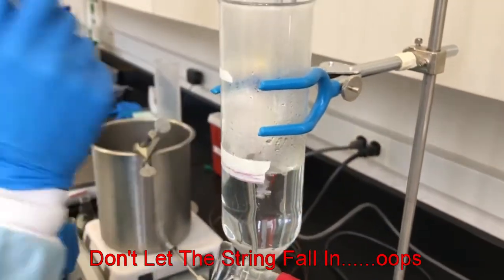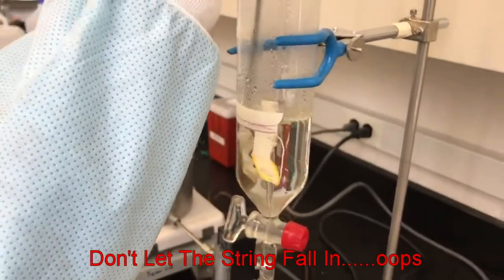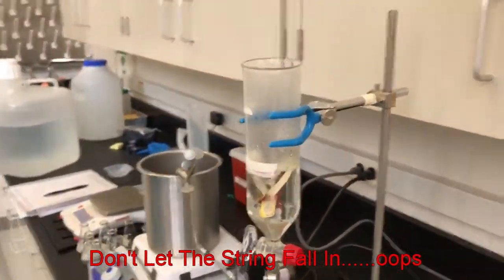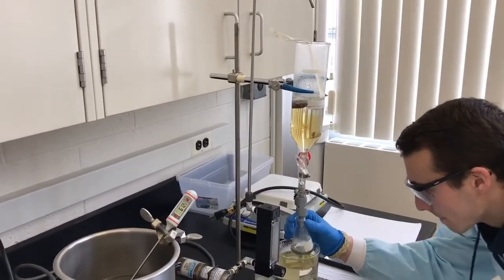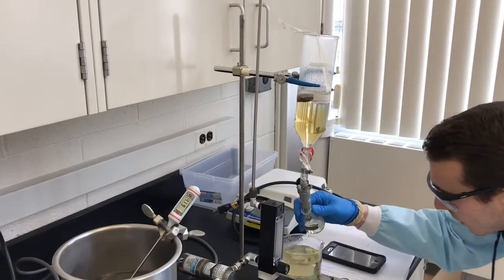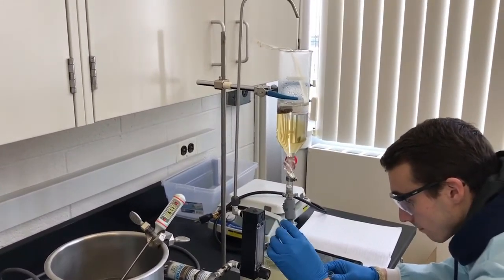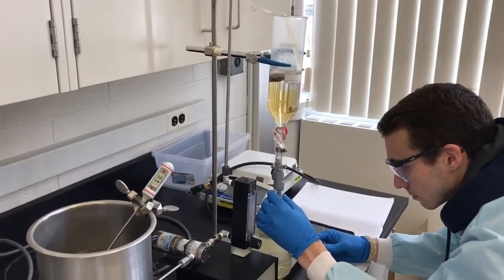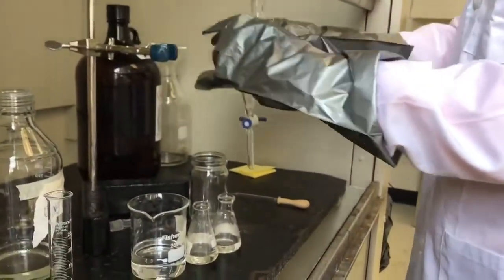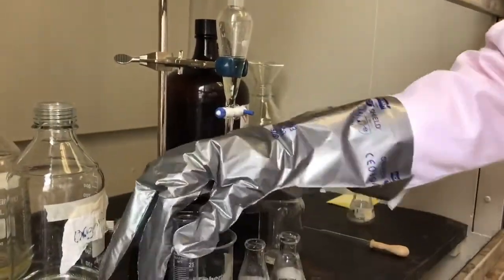After determining your reactor volume, place the coffee bag in the reactor and get ready to extract some coffee. Extract 3 different samples at 3 different time intervals of your choosing. Transfer your 15 milliliter sample of coffee, while also transferring 15 milliliters of dichloromethane.